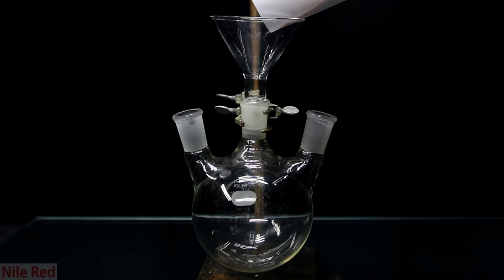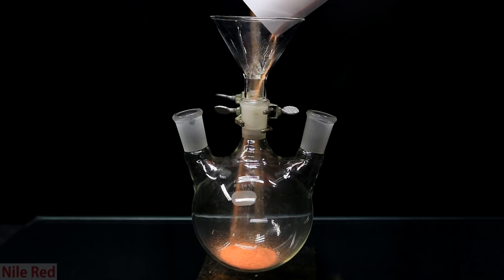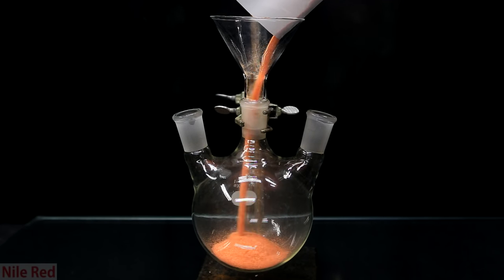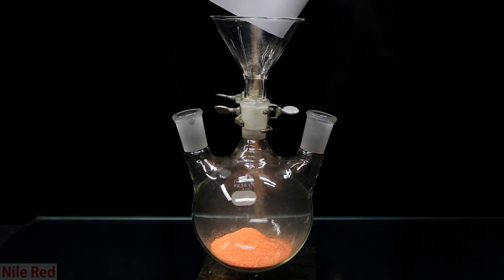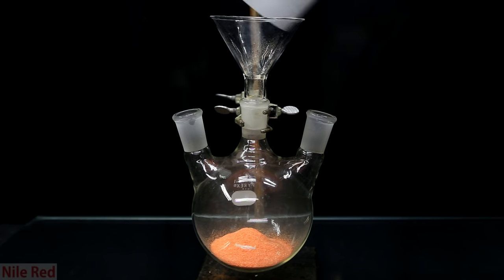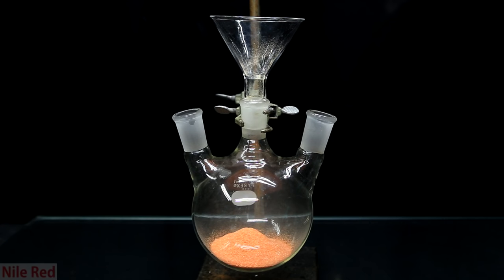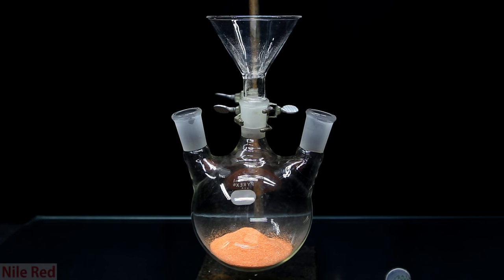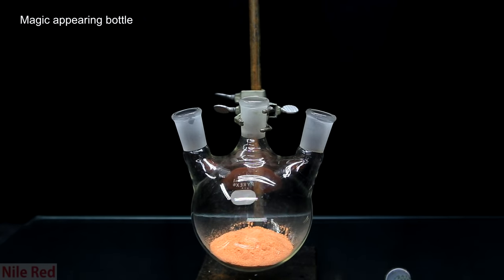Anyway, once it seems like it's a uniform color, I add it to a 3-necked 1-liter round bottom flask. It's important to use a funnel here so none of the powder gets into the ground glass joint, because that would compromise the seal. I then remove the funnel, and I add a stir bar.